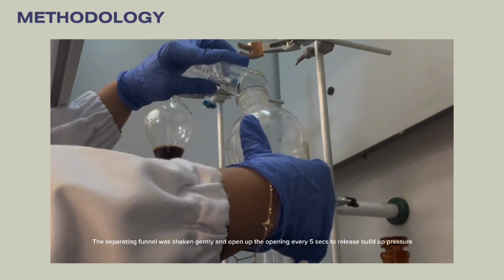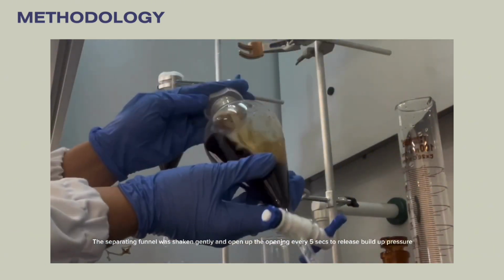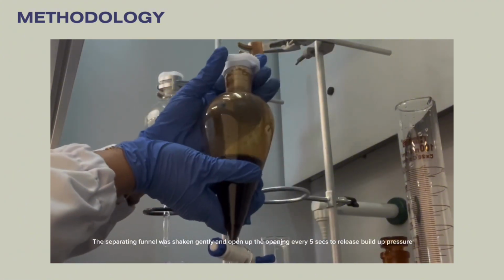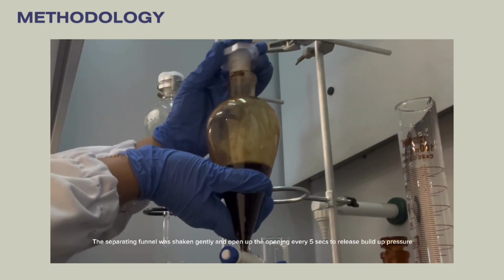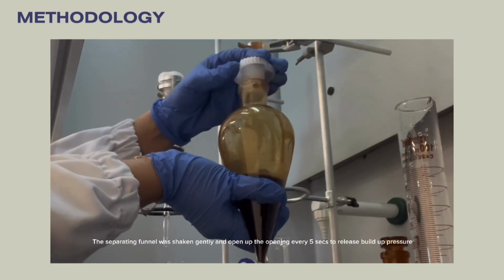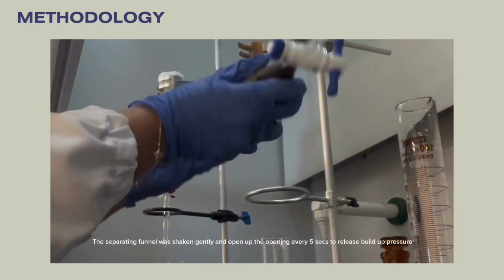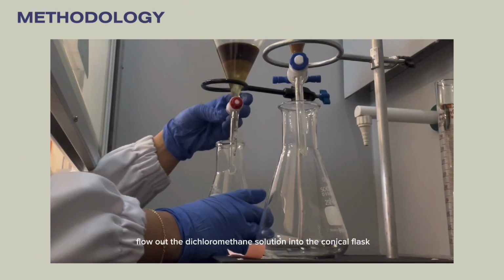The separating funnel was shaken gently and the opening was opened every 5 seconds to release built-up pressure. Flow out the dichloromethane solution into the conical flask.